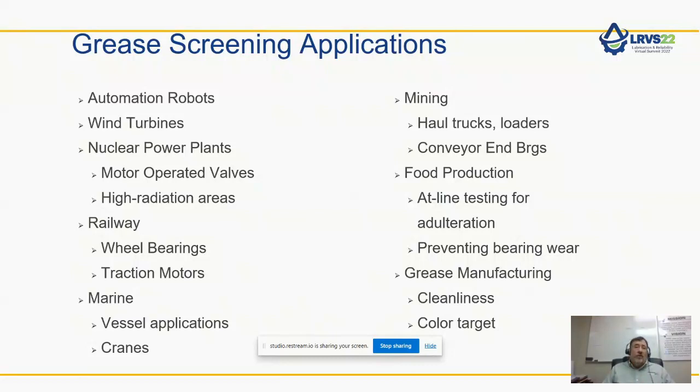And really, what prompted me to develop a colorimetric method for greases was working with a robot automation repair technician, who we were out in the field taking samples one day. We took a bunch of samples from a number of different robots. And he said to me, robot 3 and robot 8 are going to be your problems. I'm like, oh, do you have other data that you know that? He says, no, I can just tell by looking at the grease.